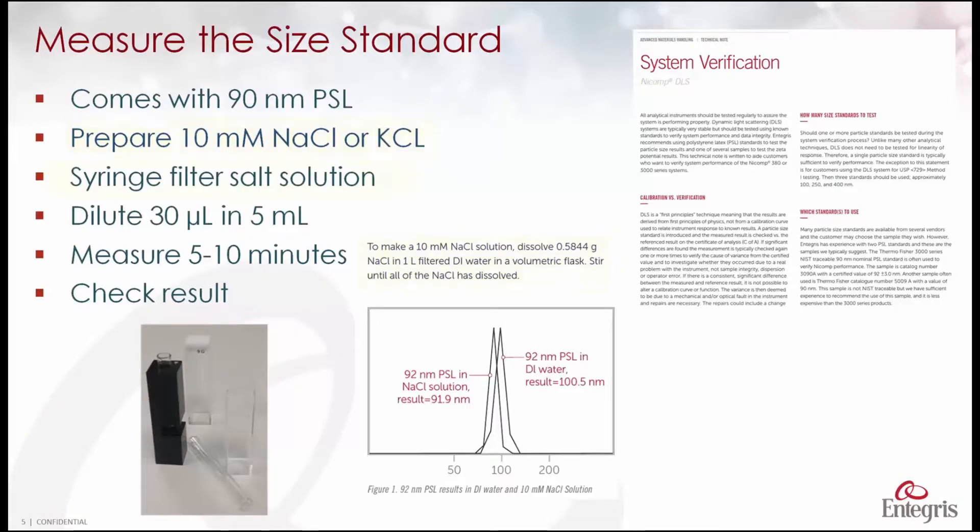We'll filter this to remove any particles. We'll then take 30 microliters of the standard and dilute that into 5 ml of the filtered salt solution.